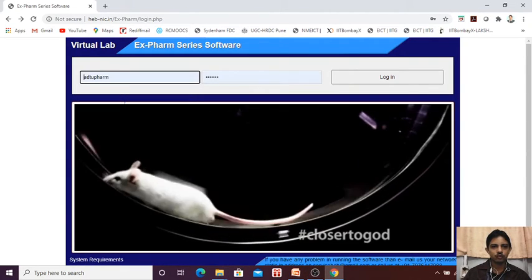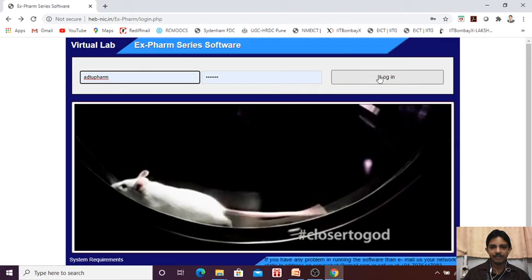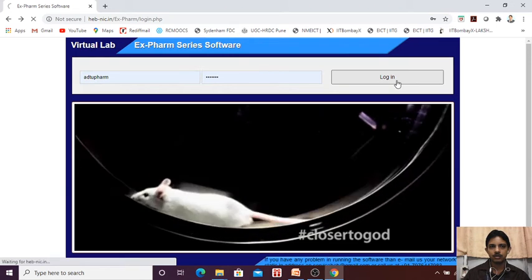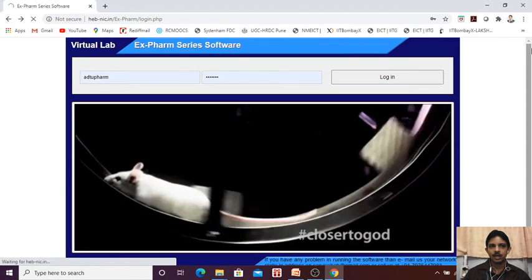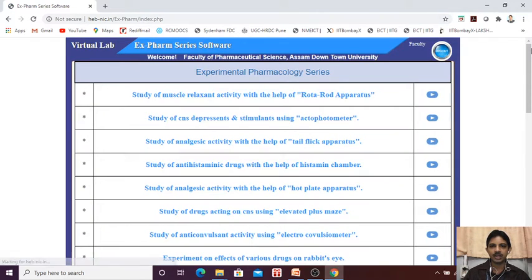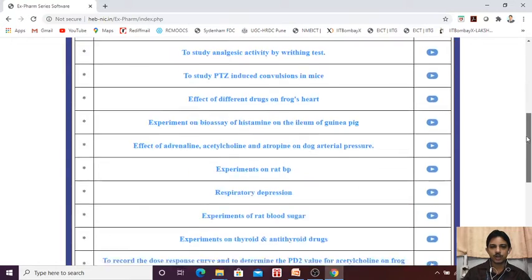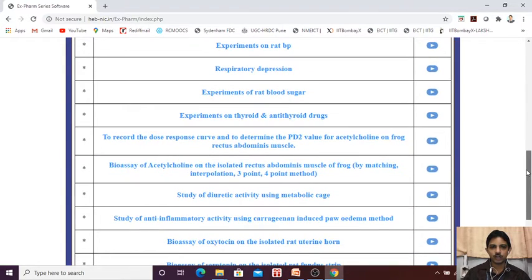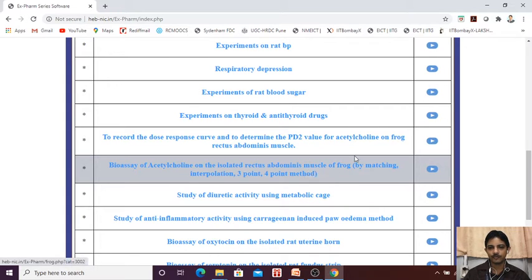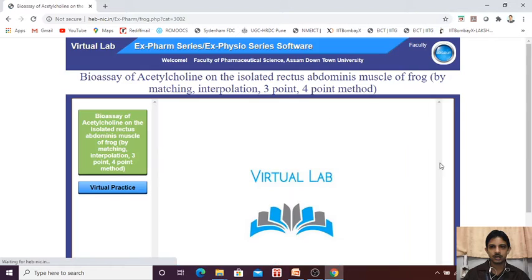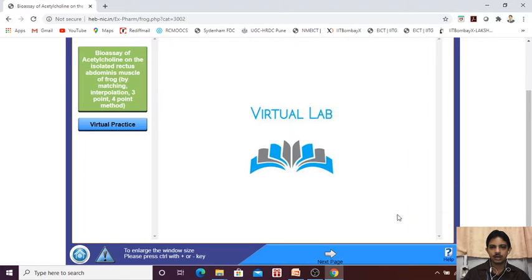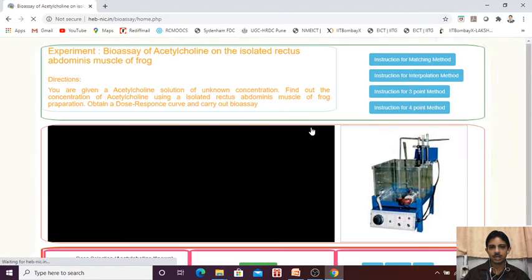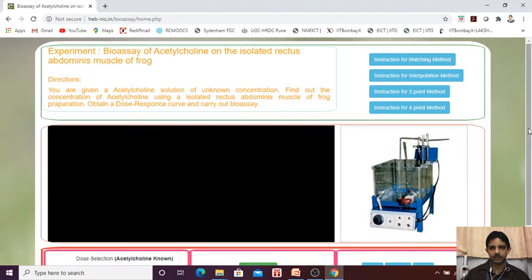Go to the login page and after login, what we are going to find, we are going to find this bioassay of acetylcholine on isolated rectus abdominis muscle of frog. Click, next page, click into the experiment.